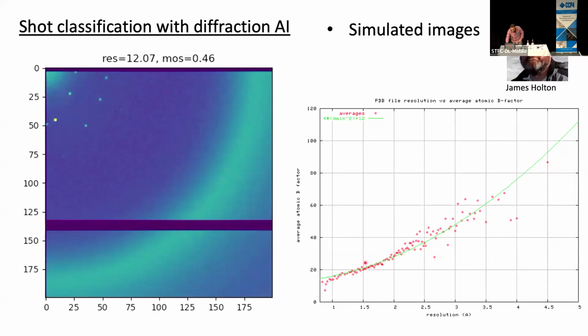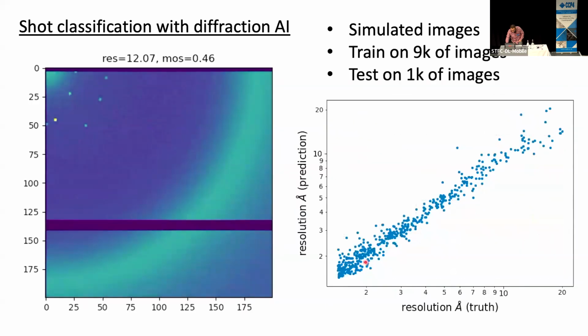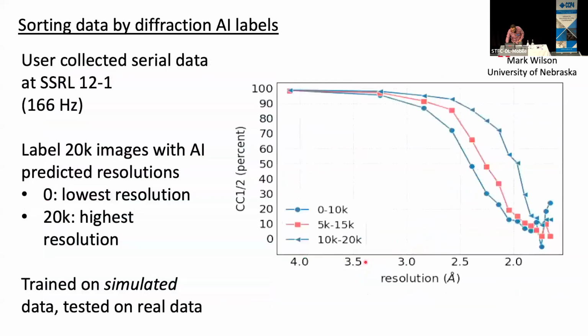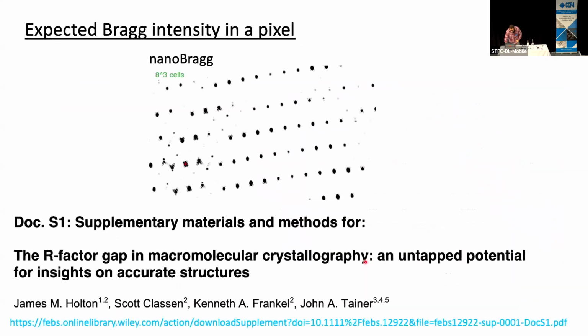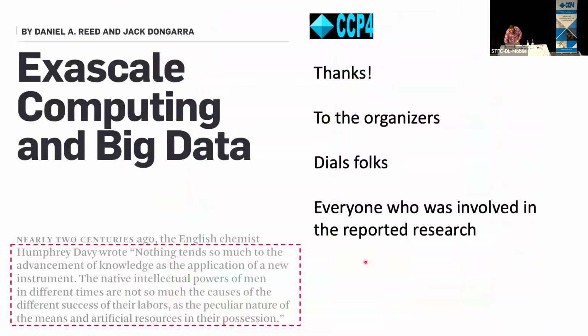I'll just say quickly that we're able to predict resolution from diffraction patterns that could then be used to sort images and maybe process those images first. I'm going to skip to the, sorry, way too many slides.